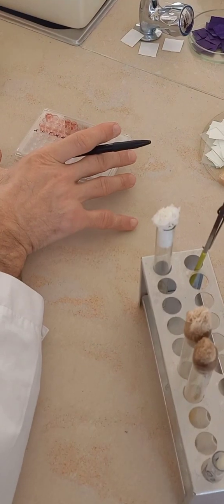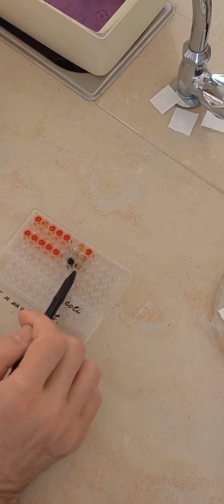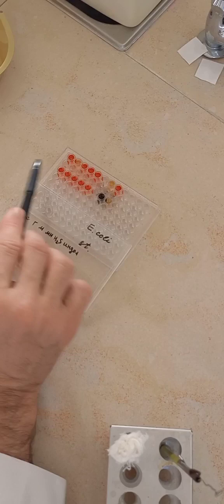Possible to close, you will see, okay? So this is H2S positive, indole negative. And opposite to this one, E. coli, indole positive, H2S negative. Sugars.